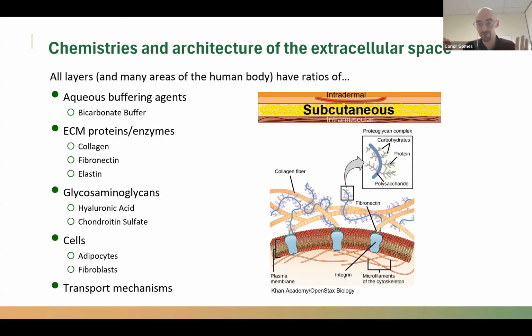So on something like HPLC, it will look very different than something on Rainbow. That being said, we have the ability to manufacture the inner cartridges with various pore sizes and membrane materials. So we do have membranes that we can drop down that pore size so the enzyme has a very small chance to leave, so that all enzymatic action can happen within the cartridge. So in this experiment, things were free flowing with a massive bias for them being in the cartridge, but there are ways to fix that to be a cleaner experiment, where you would slow everything down, but you wouldn't get diffusion of that enzyme out of the cartridge.